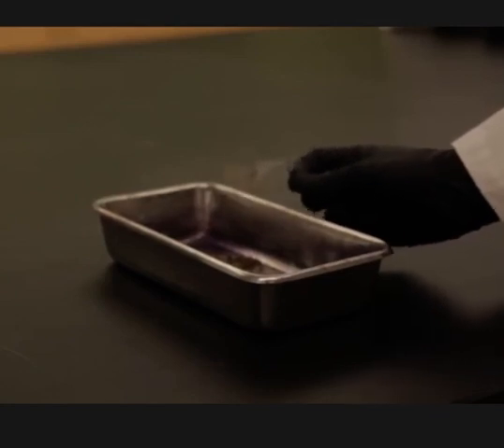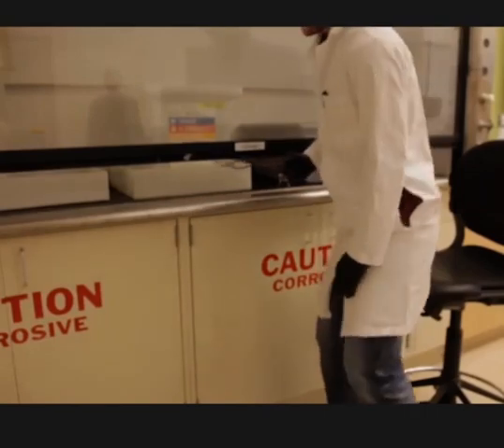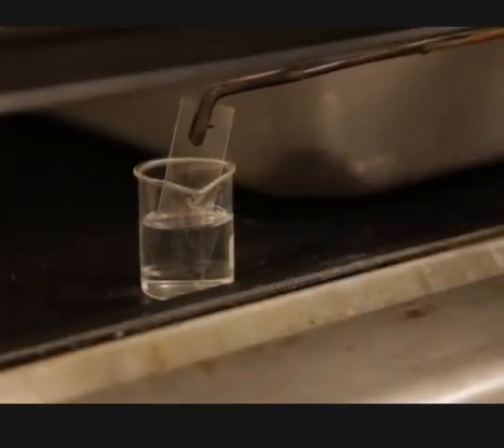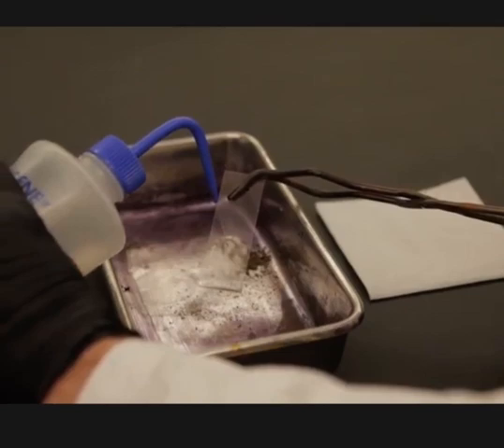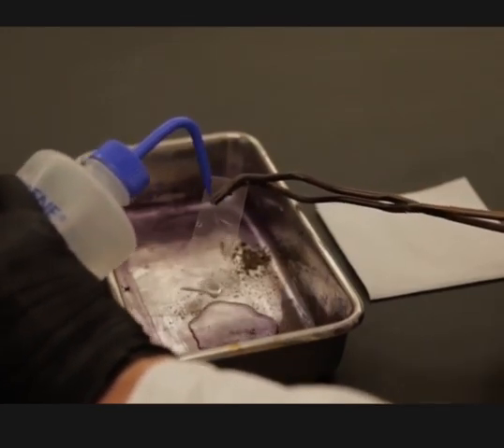Gently tap the slides to remove large soil particles. Using a damp paper towel, clean the lower face of the slides. Allow them to dry at room temperature in a fume hood. Once dry, pick up a slide with forceps and immerse it into acetic acid for 1 to 3 minutes. Rinse the top of the slide with a gentle stream of distilled water to remove excess acid.